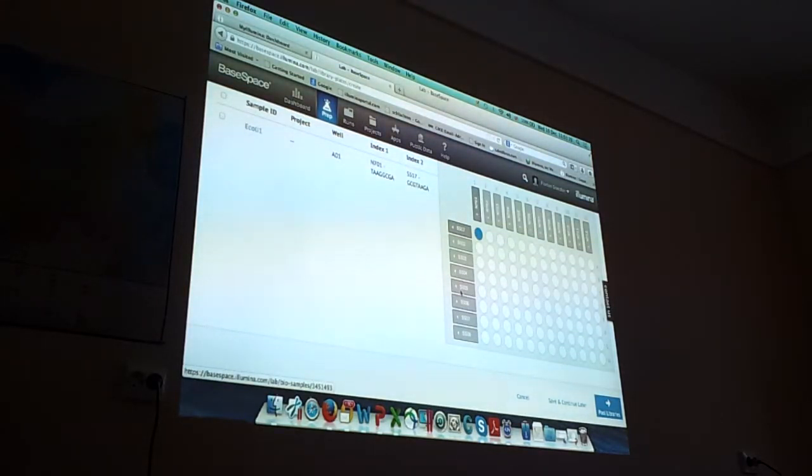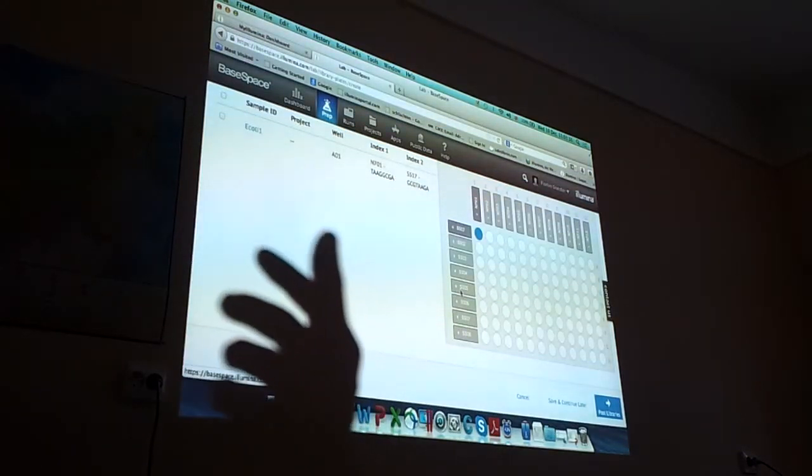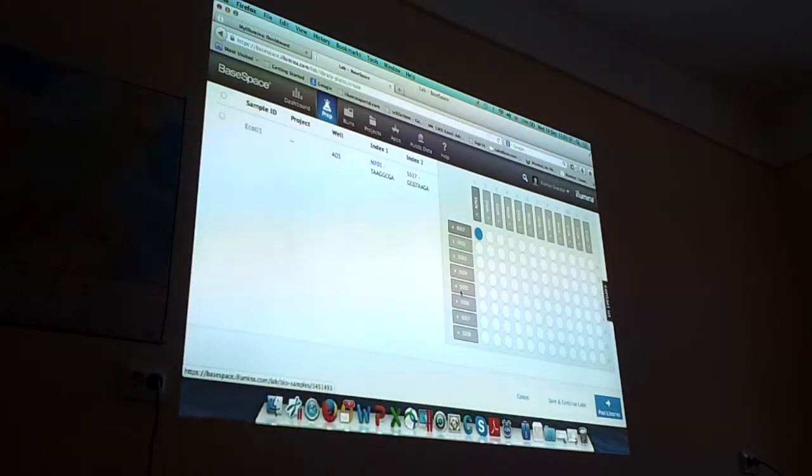So G, if you remember, it's dark. For a normal read, it would not be a problem to have 2 G's. You cannot have 5 G's. But if you sequence the index, it is much shorter. There you cannot have 2 G's at the beginning. So you should choose an index that does not have 2 G's.